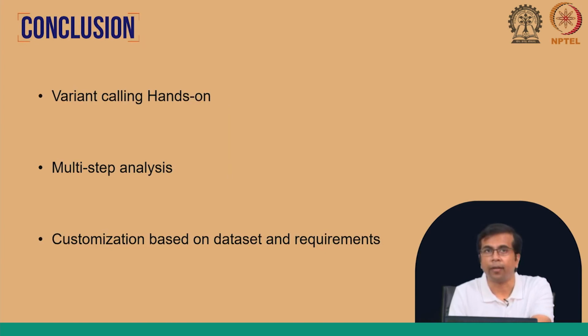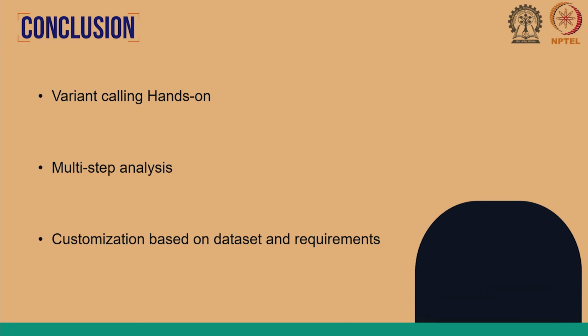So we have learned how to do the variant calling ourselves, and we have seen this is a really multi-step analysis. Of course, within a very short period of time it is not possible to show all the steps and all the options that are available, and we can also customize these options based on data sets and requirements.